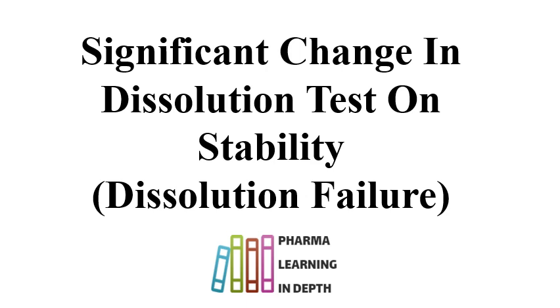That's why the dissolution test is related to the safety and efficacy of the formulation, and failure of the dissolution is categorized under significant change in the stability study. And if dissolution failure occurs, if it is a significant change, then the product fails in the stability study.